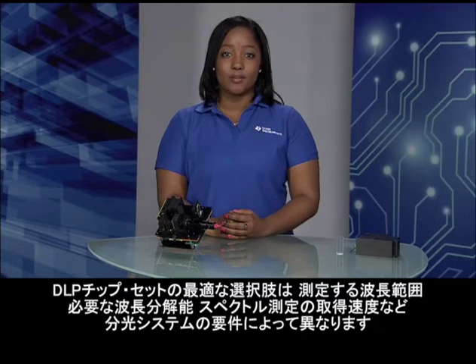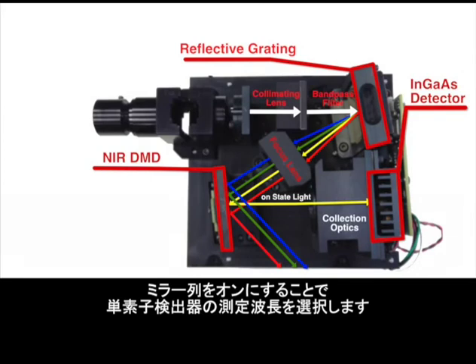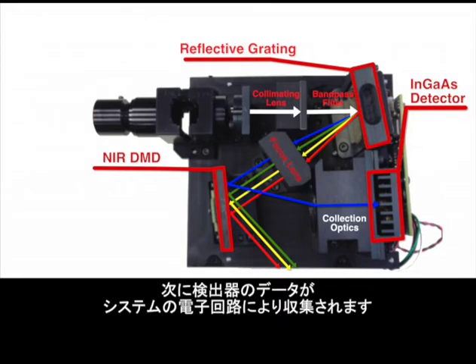Various DLP chipsets are available, with different DMD array sizes, resolutions, maximum pattern rates, optimized wavelength ranges, and other specifications. The best choice for a DLP chipset would depend on the spectroscopy system requirements, such as the range of wavelengths to be measured, the desired wavelength resolution, the speed of acquisition of the spectrum measurement, and more. Columns of mirrors are turned on to select the desired wavelengths to be measured across a single element detector. The data from the detector is then captured by the system electronics.